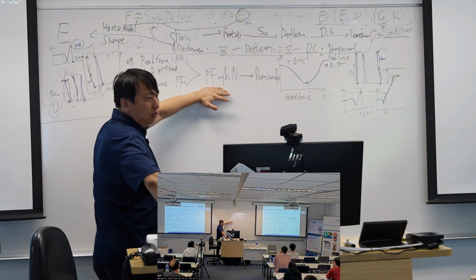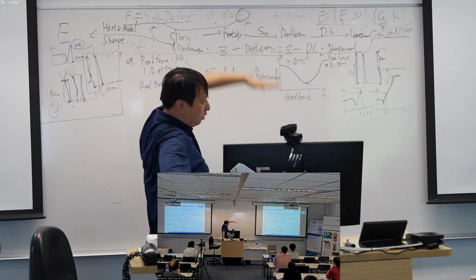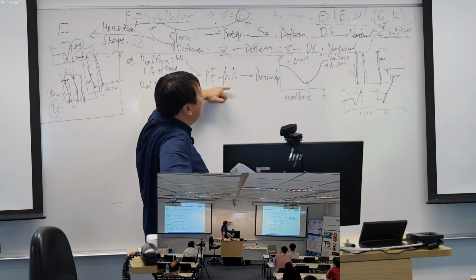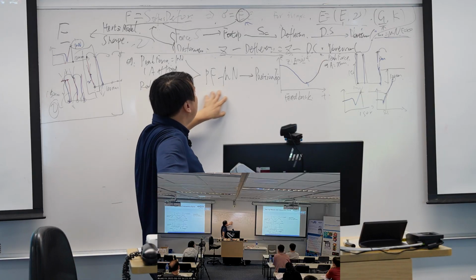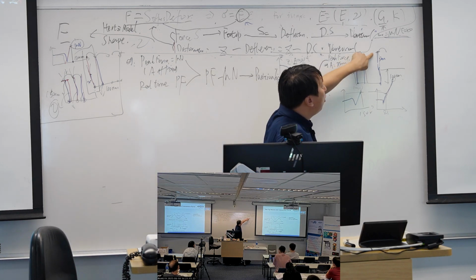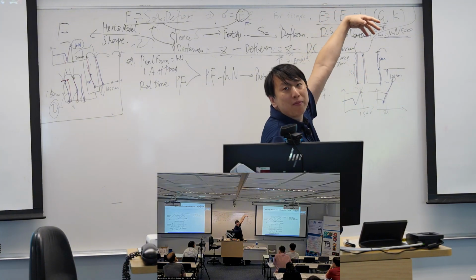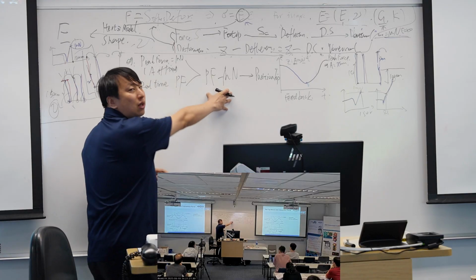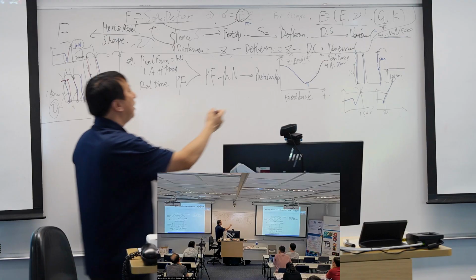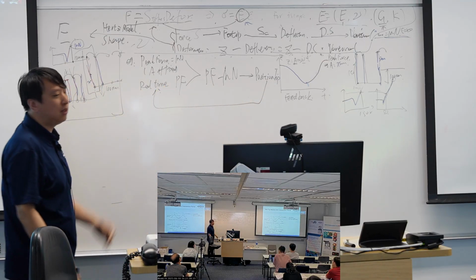If the error is 0, it means my probe is in the right position. I travel down 150 nanometers, and I can touch the surface. If this difference is larger than 0, that means my probe is too close to the sample. I need to move it up until it reaches 1 nanonewton. And as such, I can use this to control the real-time peak force.